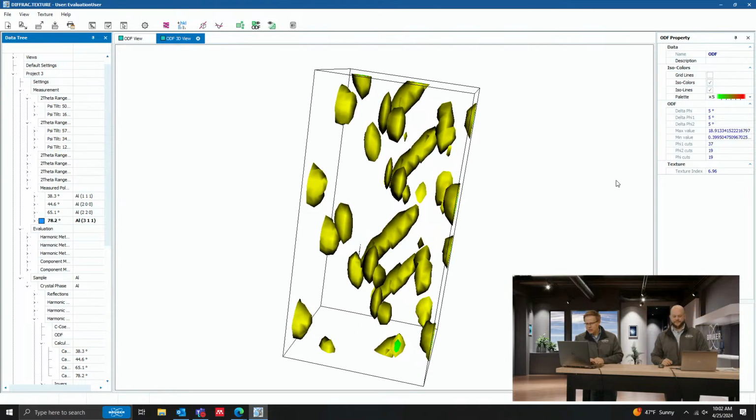All right, from Wanuk. Question number 2, is the data that was measured PXRD using a 2D detector, is it better if one can use an SCXRD machine for measuring pole figures, and what is the benefit? So starting with the question about the data, how was it collected? What kind of detectors did we use?